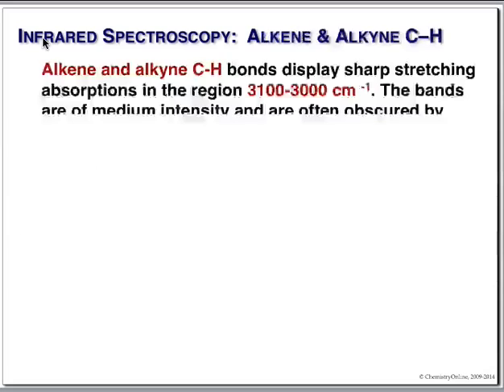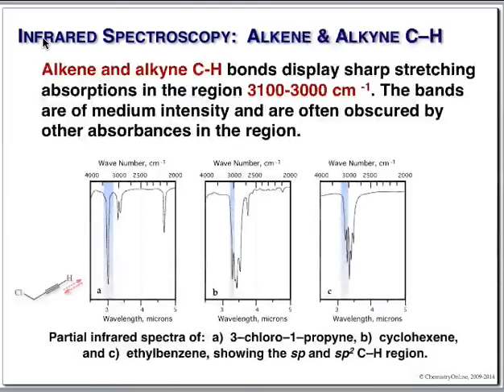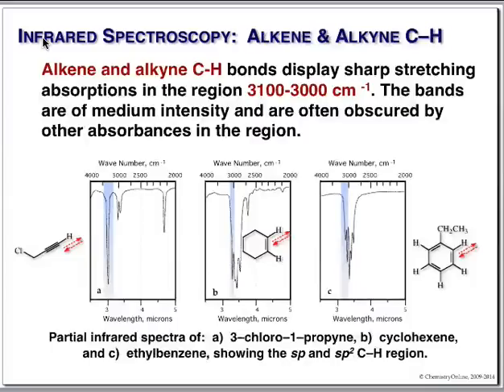All right, working our way up. This is the unsaturated CH, we'll call it. These are CH stretches of alkenes, alkynes, and aromatic rings. The champion here is going to be the alkyne CH. We'll see why in a minute, but when this is present, you typically get a big, beautiful, sharp peak in the region. Well, this is rather high, so about 3,400 or so. Big, clean, sharp peak.